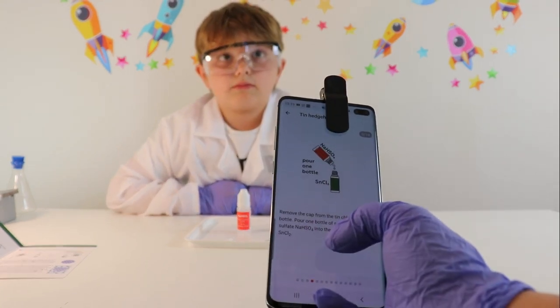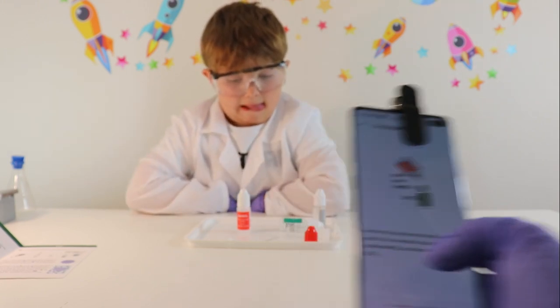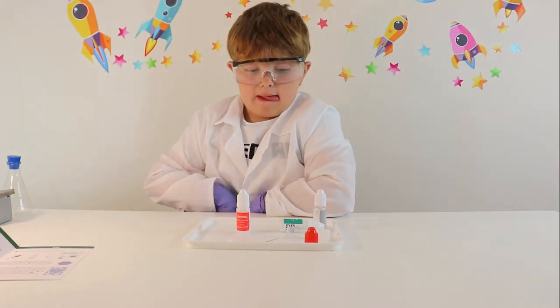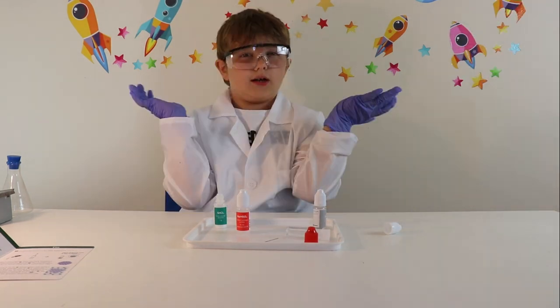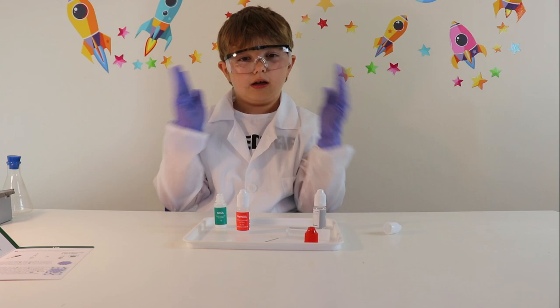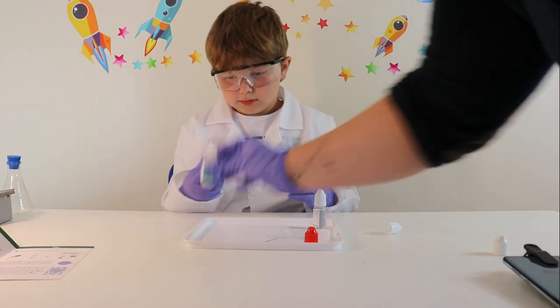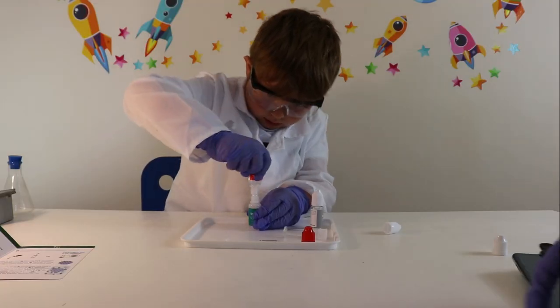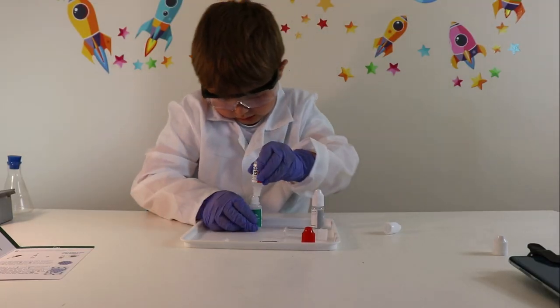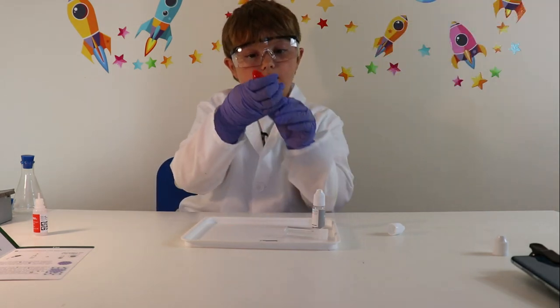Including the zinc. Next thing: remove the cap from the tin chloride, which is in the green bottle. Now it says pour one bottle of sodium hydrogen sulfate into the bottle of tin chloride, and you pour that inside this one. Ok Claire, you've got to shake this bottle for 30 seconds — one, two, three.